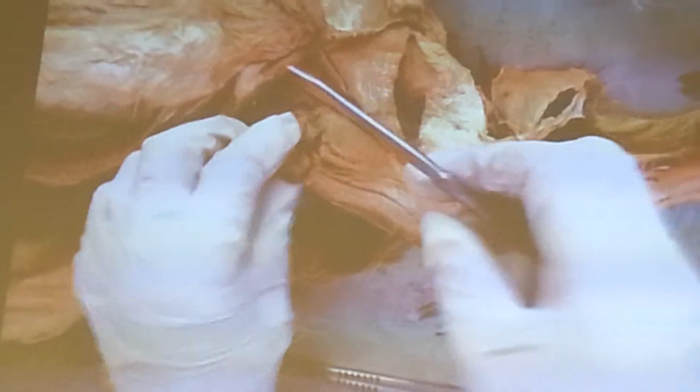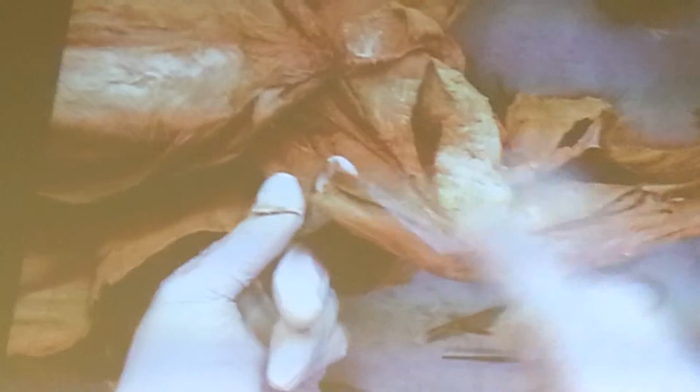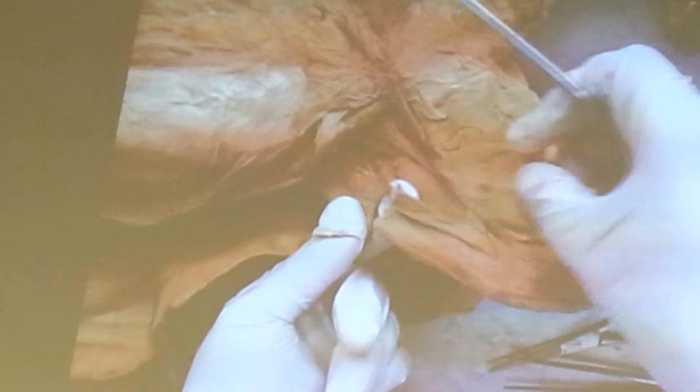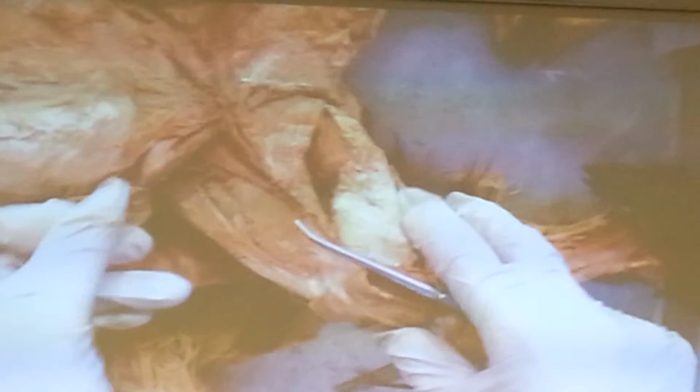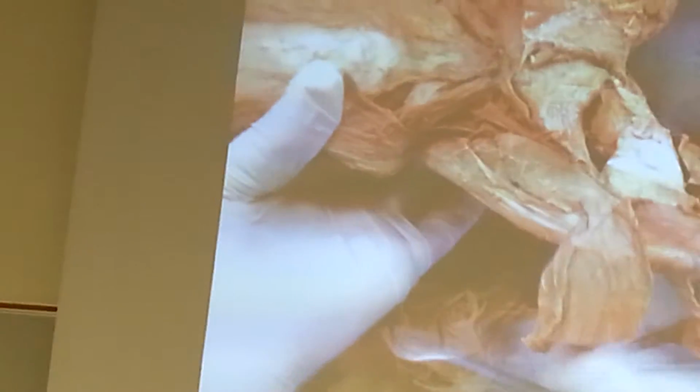On the lateral side of that, we have a superficial muscle that we call sartorius, right? And on the medial side of that, we have a superficial muscle that we call gracilis. We just cut each one and put them away. Let's go over the lateral side of the anterior of the body.